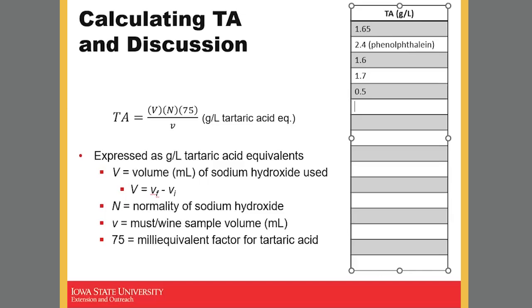So that value was probably a little less accurate because it was not looking at the same pH, not at a strict value. Otherwise, 3 values are between 1.6 and 1.7.